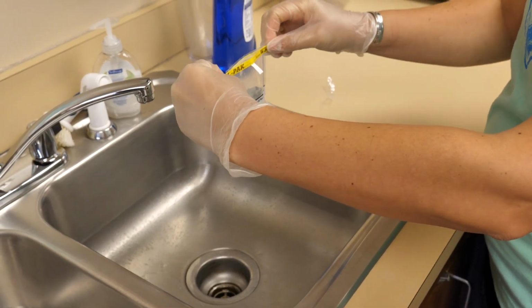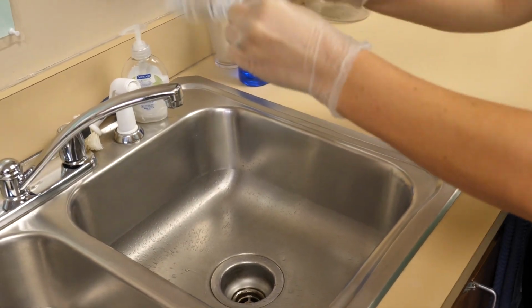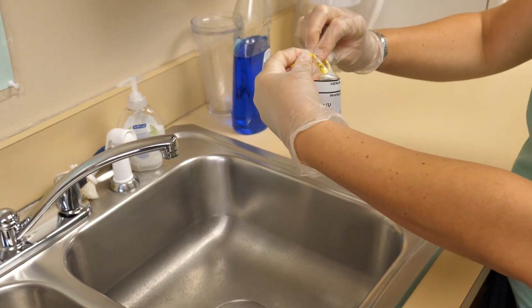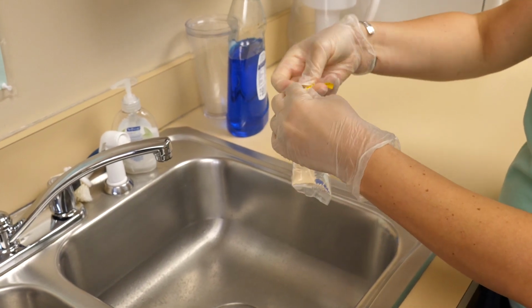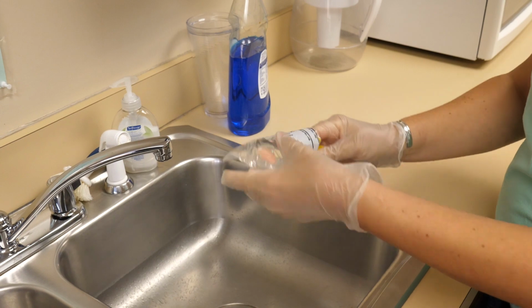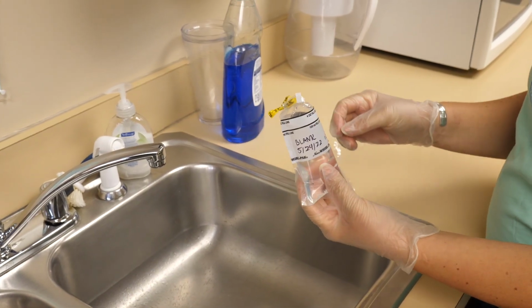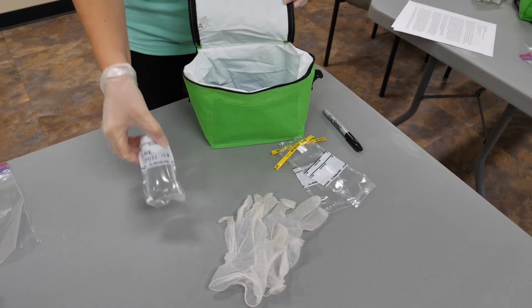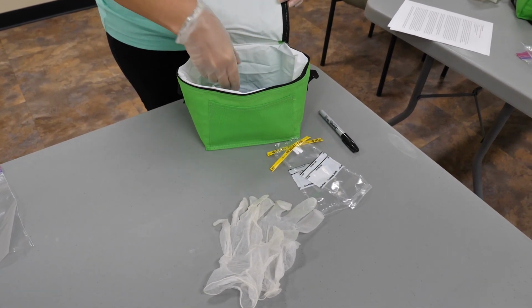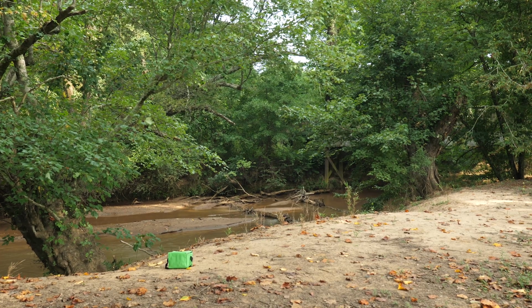Hold the bag using the ends of the twist ties and whirl the bag shut in a circular motion, spinning away from you. Look away from the bag while doing this to avoid getting hit by water drops in your face. Twist the ends together and squeeze the bag to check the seal. Then place it in your disinfected cooler on ice. Take the cooler with the blank inside with you to the field.